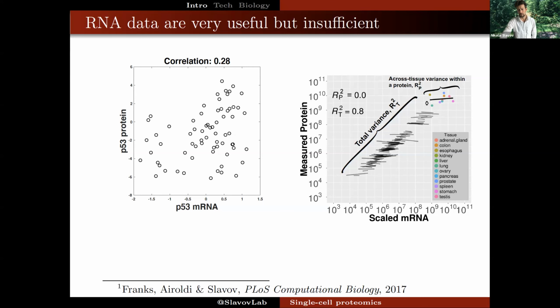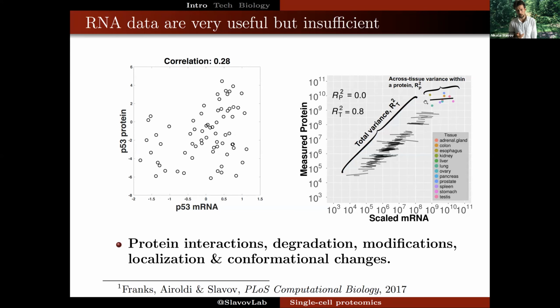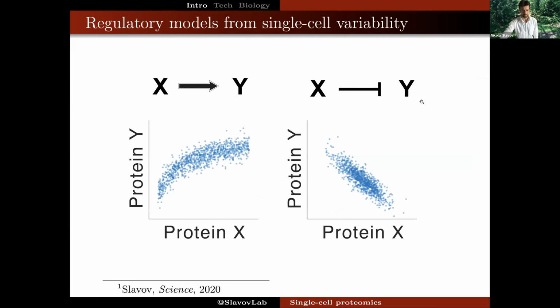And then it's not just protein abundance. What we're really interested to go into is the ability to perform single-cell measurements of protein interactions, degradation, various modifications. We'll actually have a lot more to say about this later this year, of measuring modifications, localization, conformational changes, and so on. So what I'll tell you about today are really initial steps in the direction of this long journey of being able to measure all these important functional quantities at the single cell level.